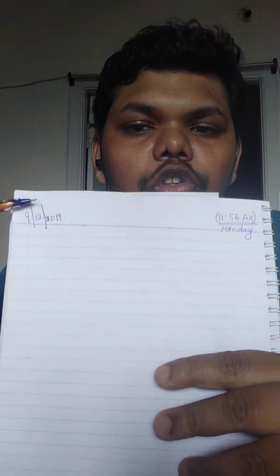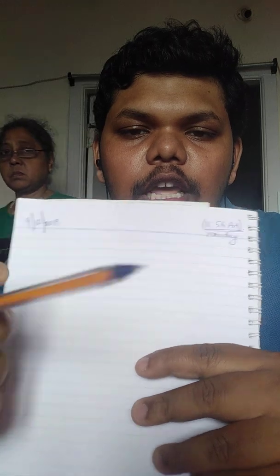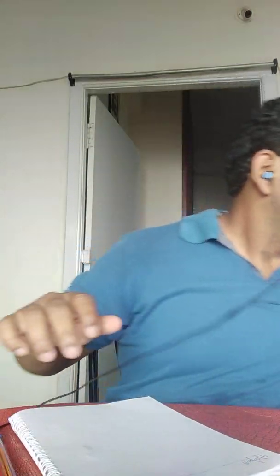If you are a domestic independent research scholar or scientist, technically called a gentleman scientist or lady scientist. Now I would like to show you what I'm going to document right now. As you can see, it's very important to note down your date, the time and the day of your documentation. It shows how perfect you are in your recording methods.